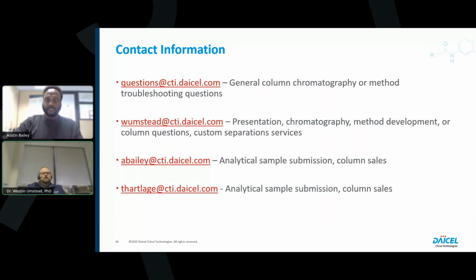I'm not sure what you mean by in the positive mode or in the negative mode. I don't know if that person is still here, if they can clarify. When I hear positive and negative mode, I'm thinking mass spec, or it could also be mixed mode functionality, but I'm not quite sure. Francis did clarify here saying one facing upward and the other downwards. Okay, so sort of like this binol or naphthol type compounds.